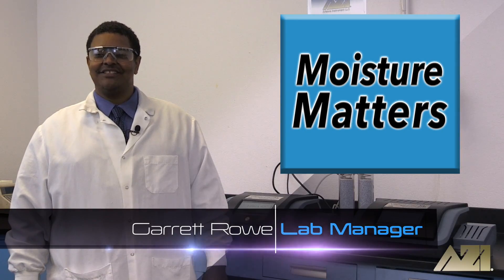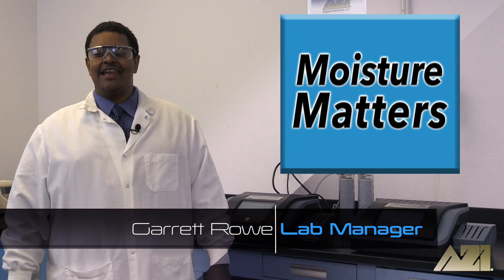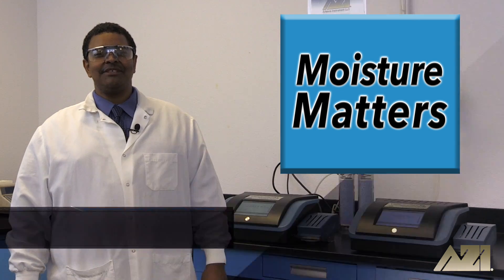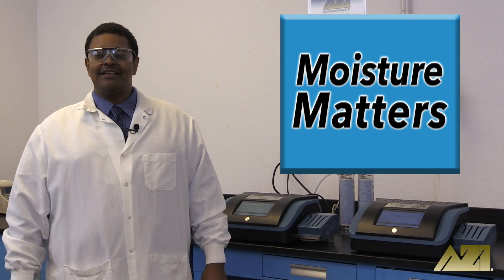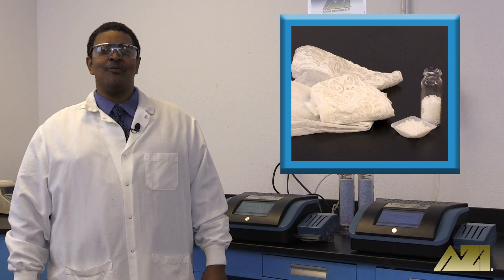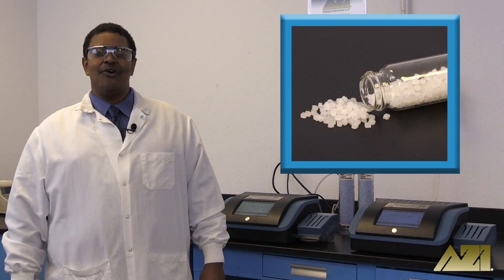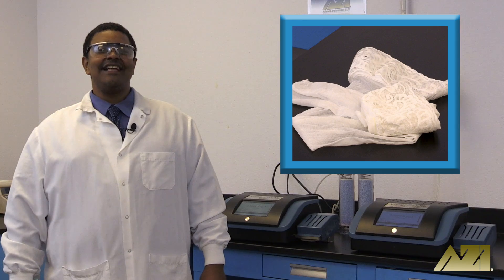Hello and welcome to Moisture Matters, the show where we take your everyday and not so everyday objects and test them to see which has more moisture. Today we're testing nylon. Which do you think has more moisture? Nylon pellets or nylon pantyhose? Let's find out.